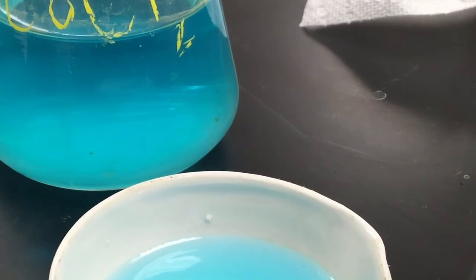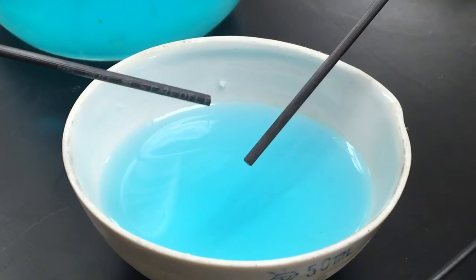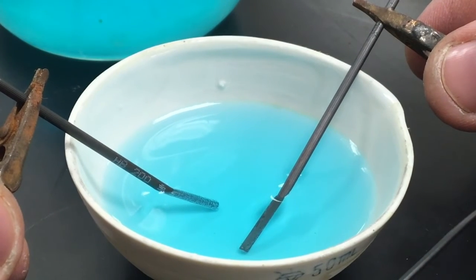So let's go ahead and zoom in because this is going to be kind of subtle here. We're going to have to focus on what happens at each of these electrodes in this solution.